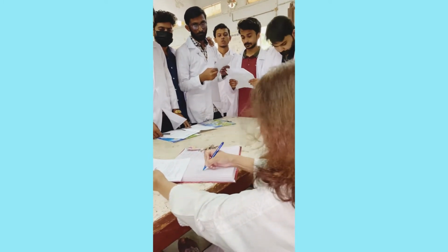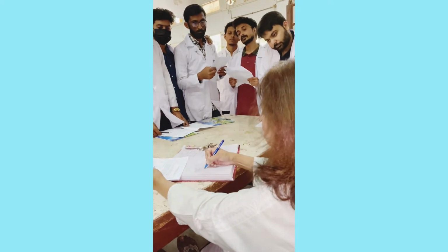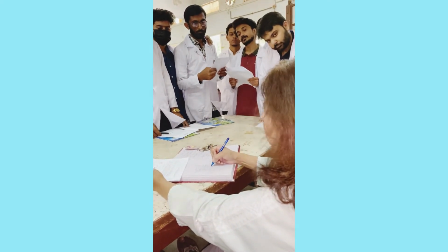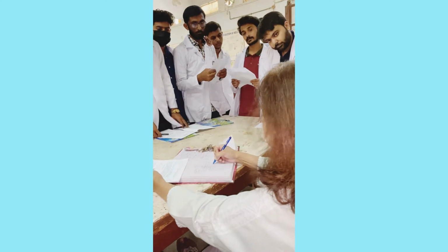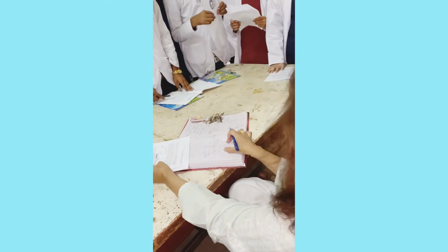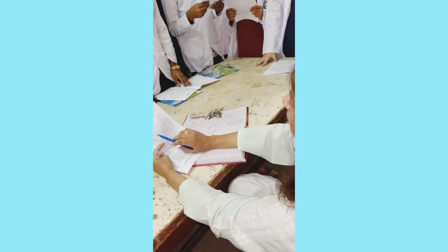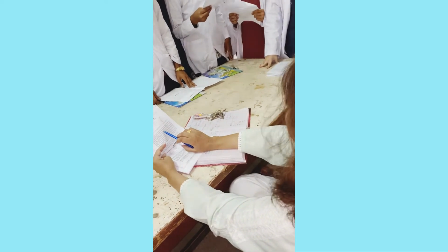So you have this ice bath here, or use cool water. Go into the final year lab, there is an ice machine. See if it's working and take out ice from there. Otherwise use cool water. Immerse your conical flask into it, right? Now cool the flask in an ice bath.